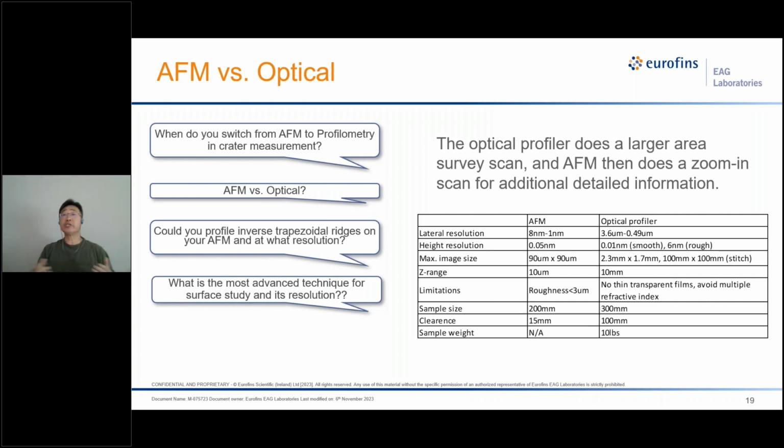However, there are instances, such as the surface topography waviness in the CMP process, or defects in wafer and device technologies that are too small, below the optical resolution limit, so that only AFM can quantify the critical dimension accurately and non-destructively. This is where merging of both techniques, for survey scan and zoom-in scan, switching between the two methods, is suitable.